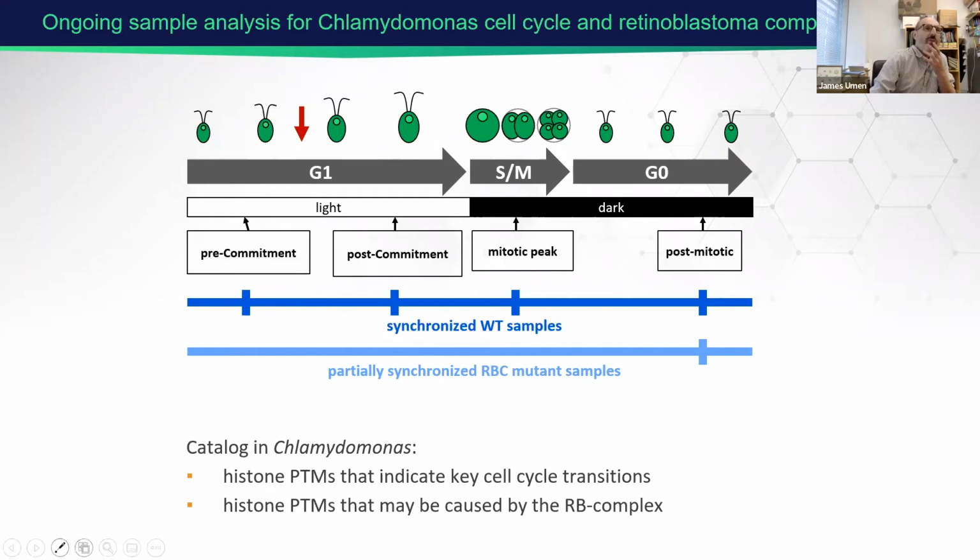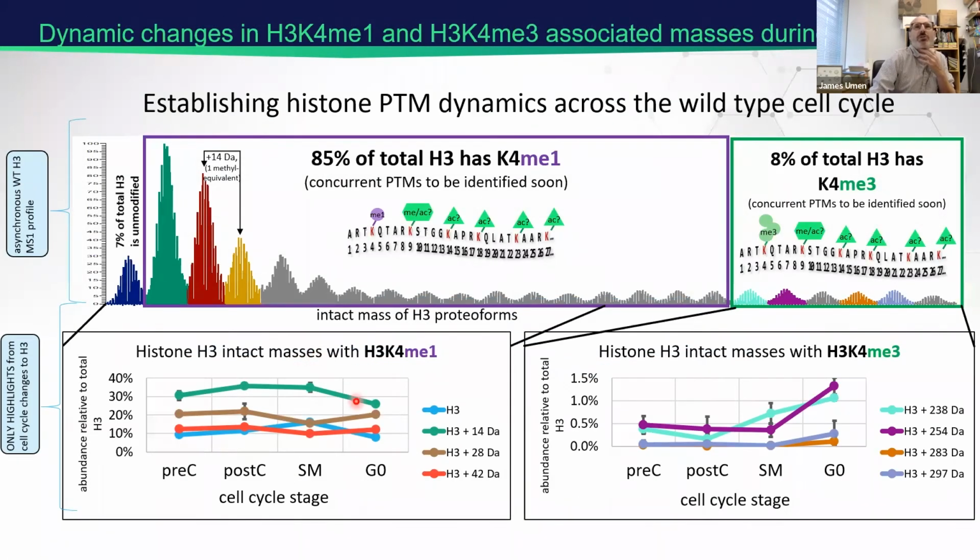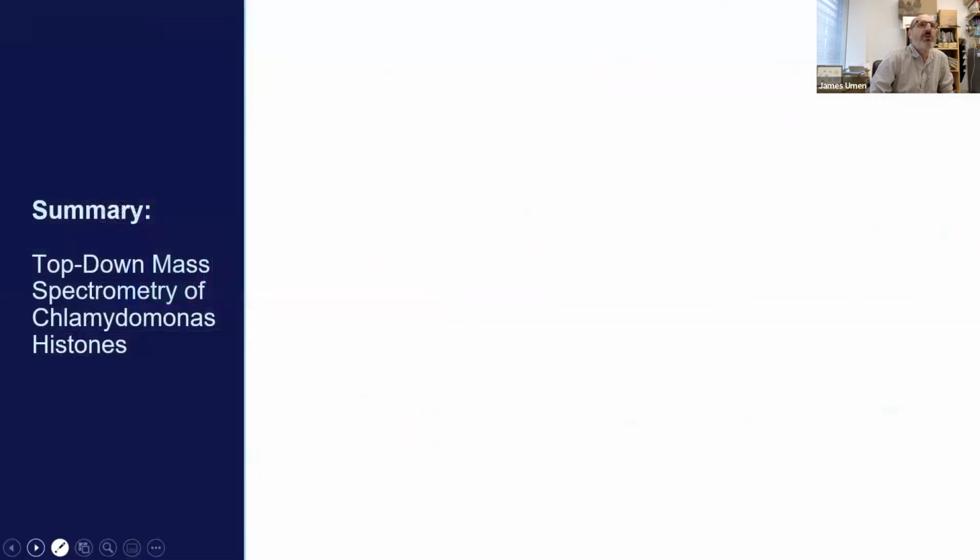I think the next slide that shows up just shows again that some of even these histones we saw asynchronously do change somewhat dynamically during the cell cycle, and having the quantitative information and the ability to quantitatively analyze this gives us additional information that we don't get from simply the bulk asynchronous data. So this is our in-progress work.